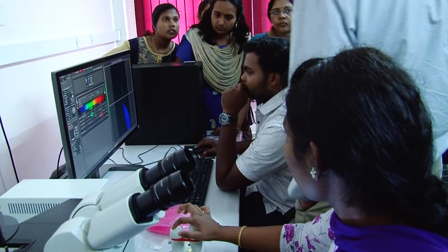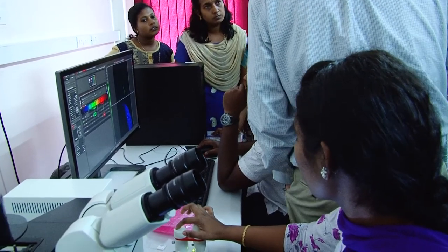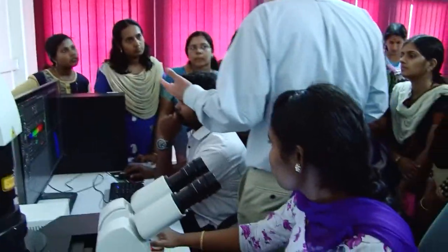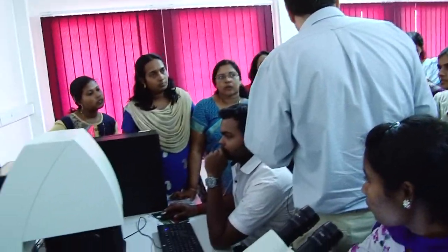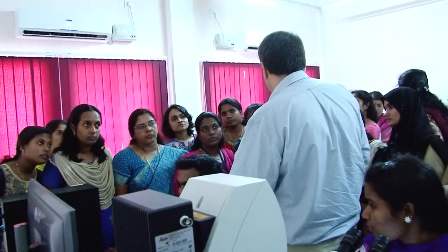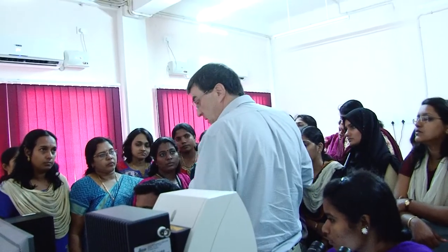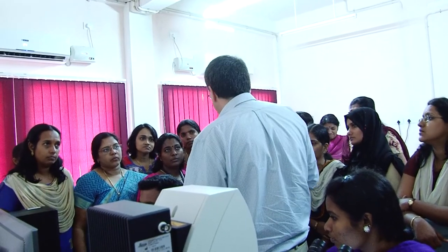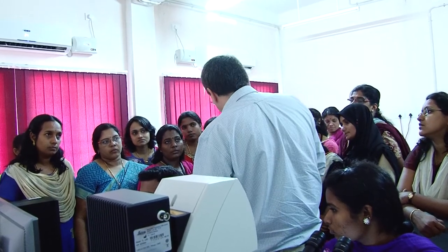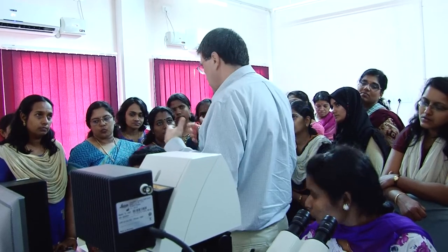Now see what it is basically. We're looking at different samples, but it's a repetition. Once you get the hang of it, once you understand how to work it, it's basically the same thing over and over and over, right? I mean, yeah, you might adjust your lasers a little because your specimen might be a little dimmer or brighter. But the idea is the same. Find a specimen, focus it, find the top, find the bottom, set up your Z stack, and then just go.